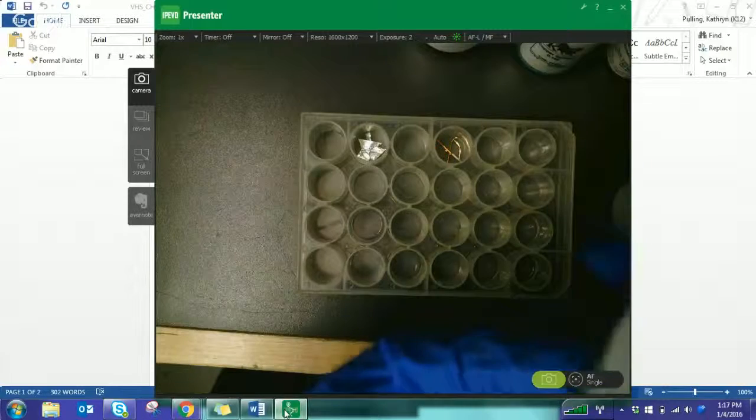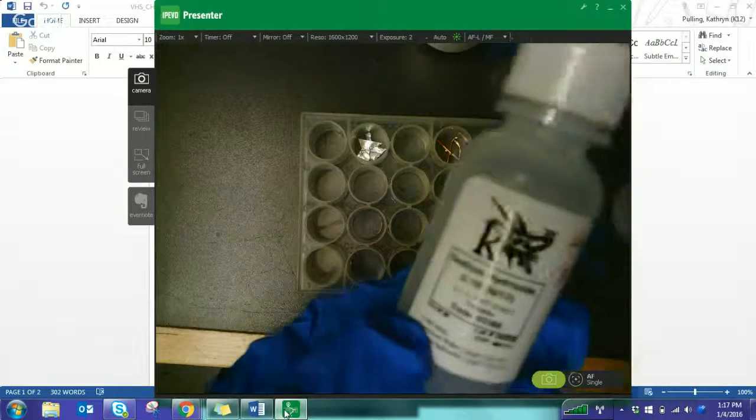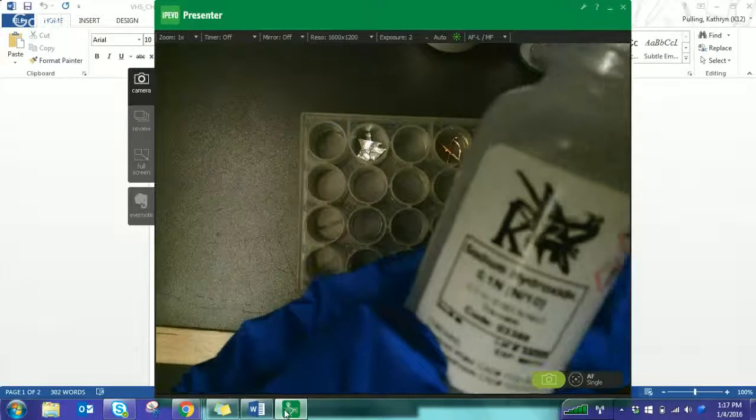And you're going to need 0.1 molar sodium hydroxide. All right, so this is a little bit of a bigger one. You're also going to need this for the Unit 6 lab, so don't use this all up.